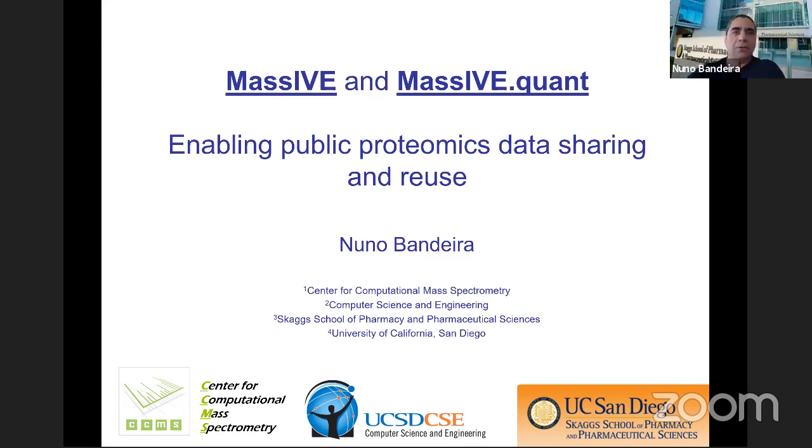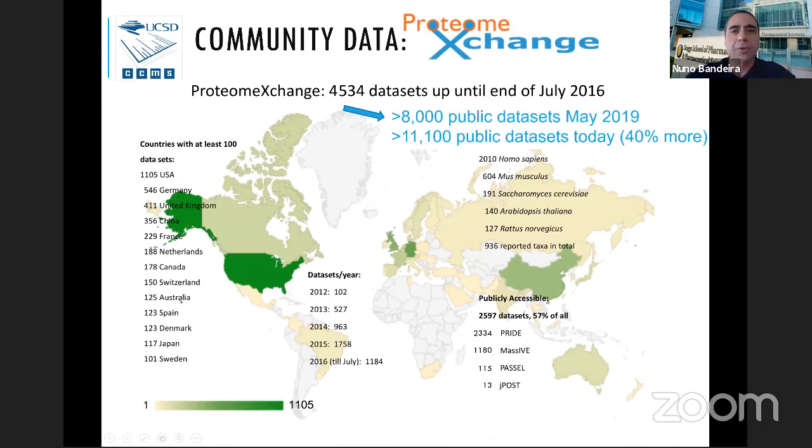So data sharing in proteomics, you've probably heard of the Proteome Exchange Consortium. If for no other reason, when submitting your papers for publication, the editor would have given you that potentially annoying note at the end that tells you, oh, and by the way, you actually should share your data somewhere and get an identifier for that data set. So the Proteome Exchange Consortium is the network of repositories at a global scale that enables this service.